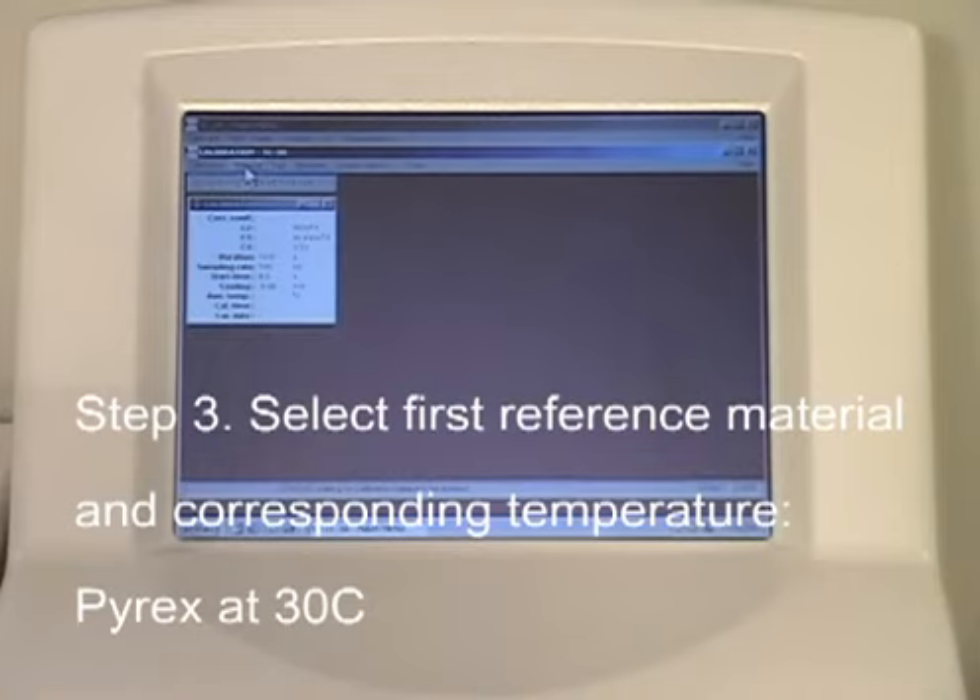Step 3. Select the first reference material and its corresponding temperature. In this example, our first reference material is Pyrex at 30 degrees Celsius.